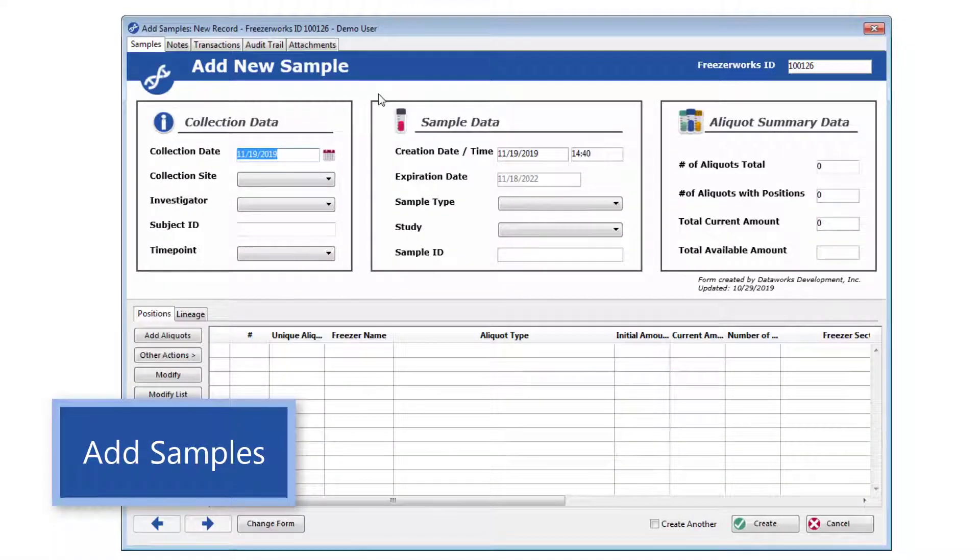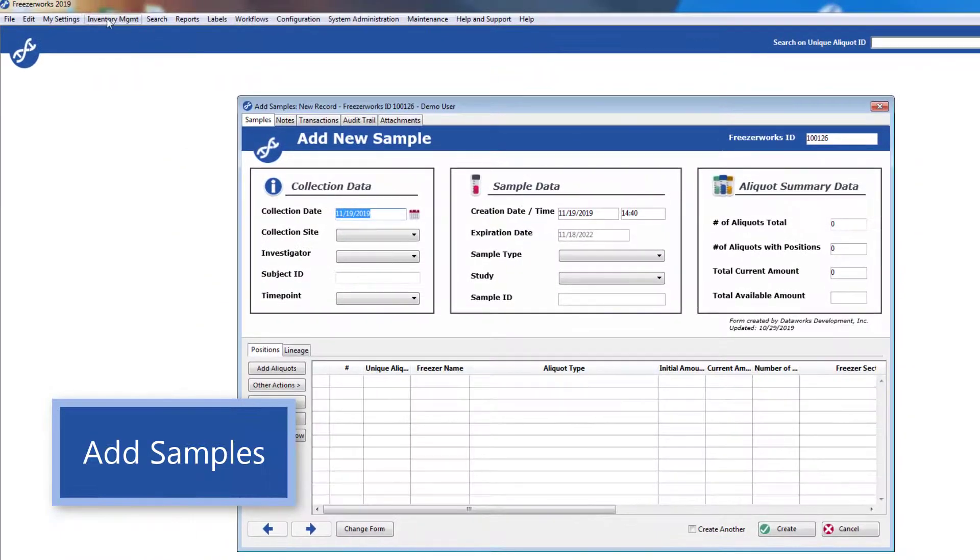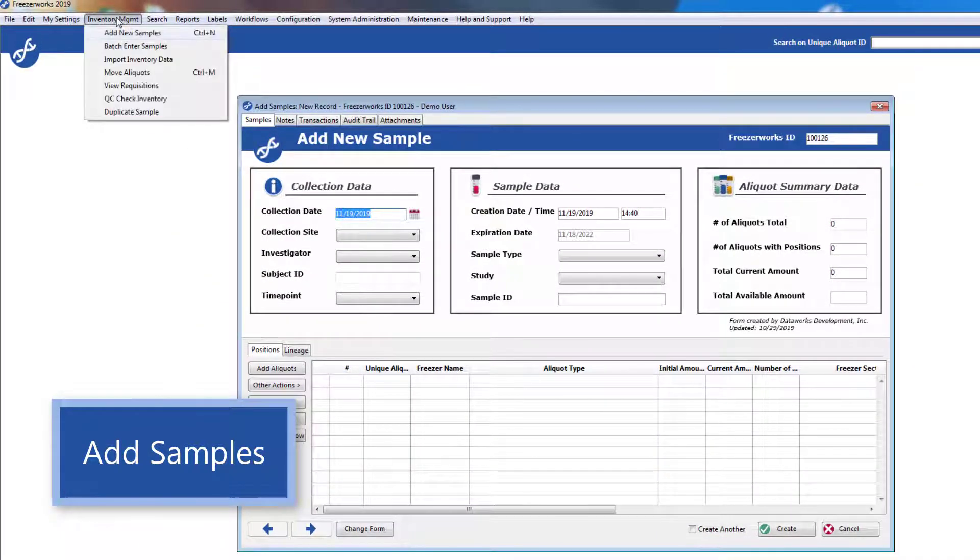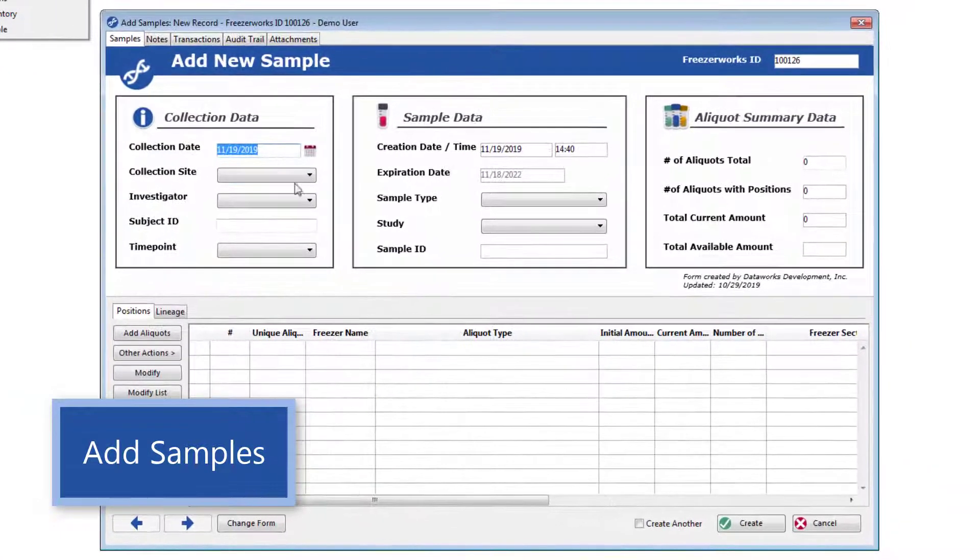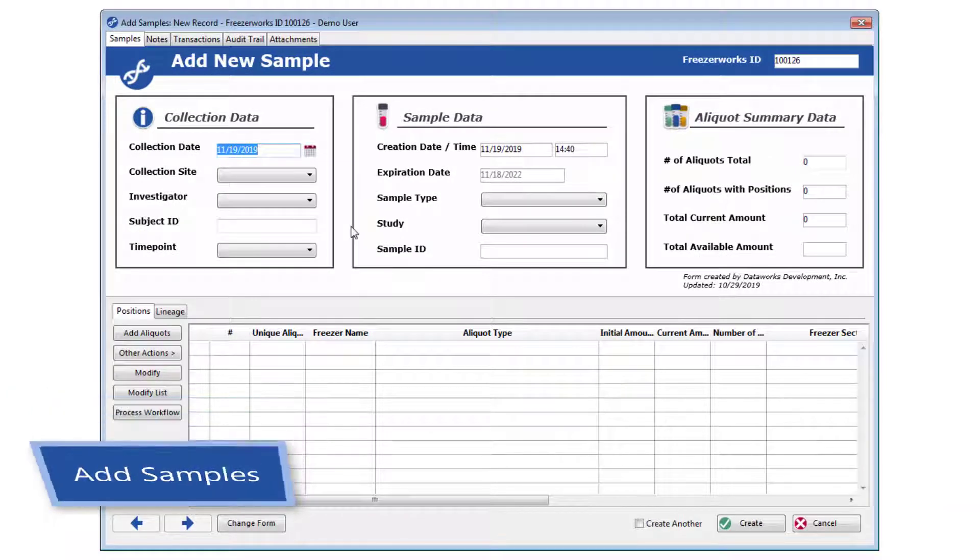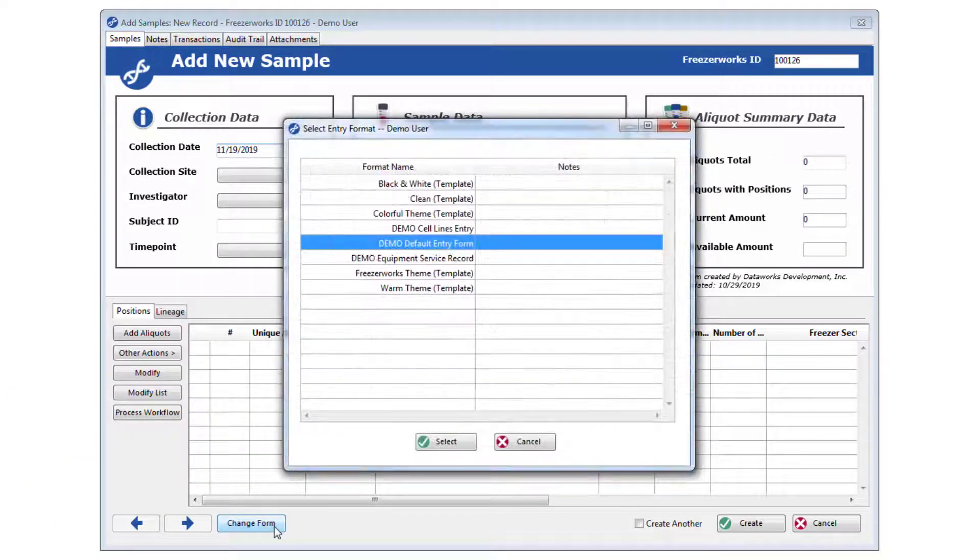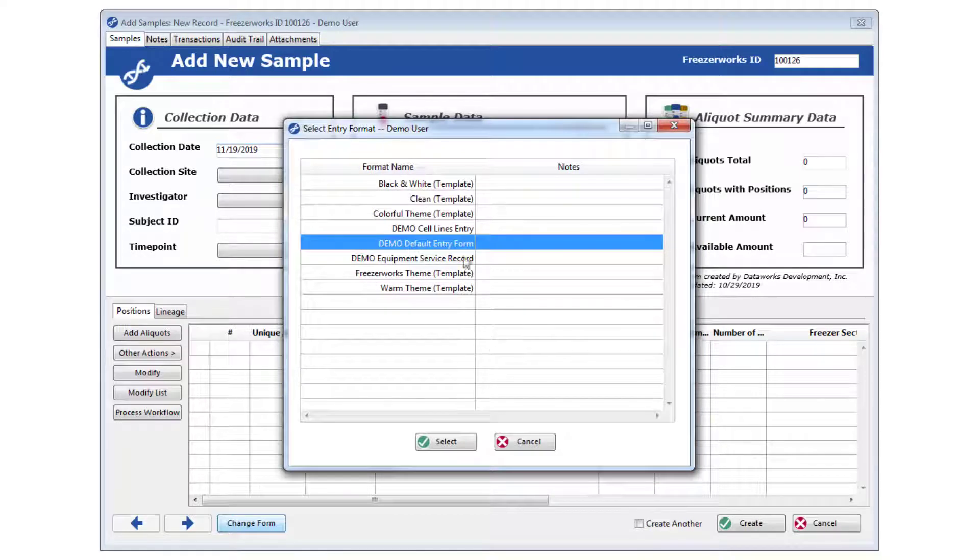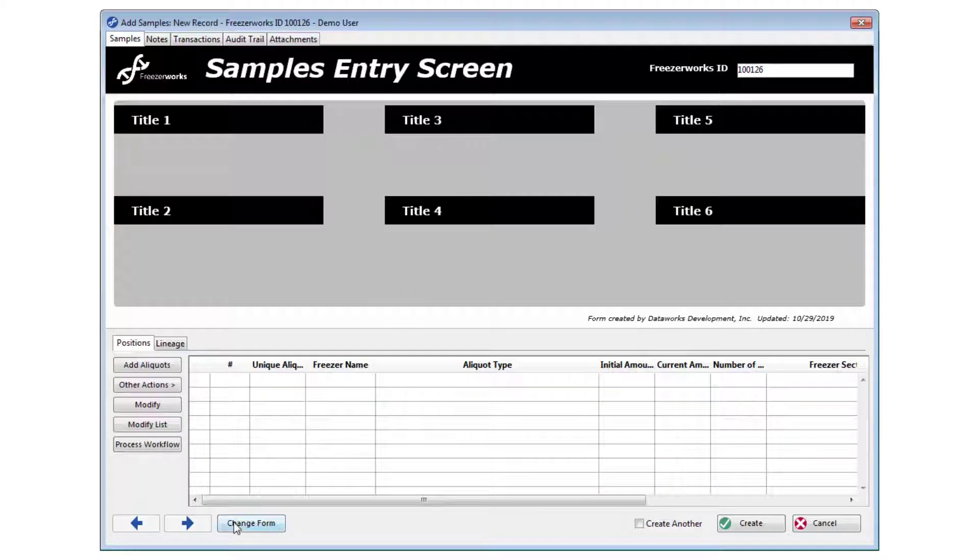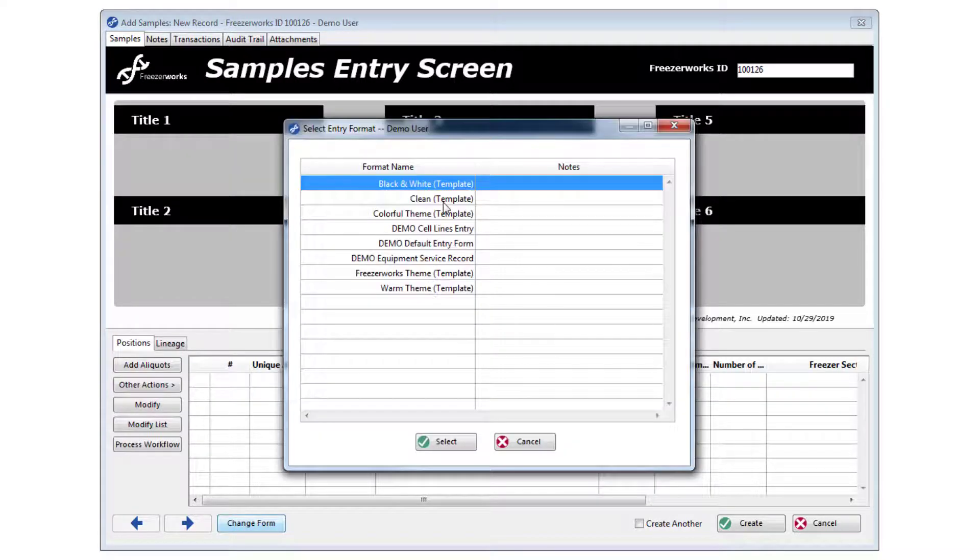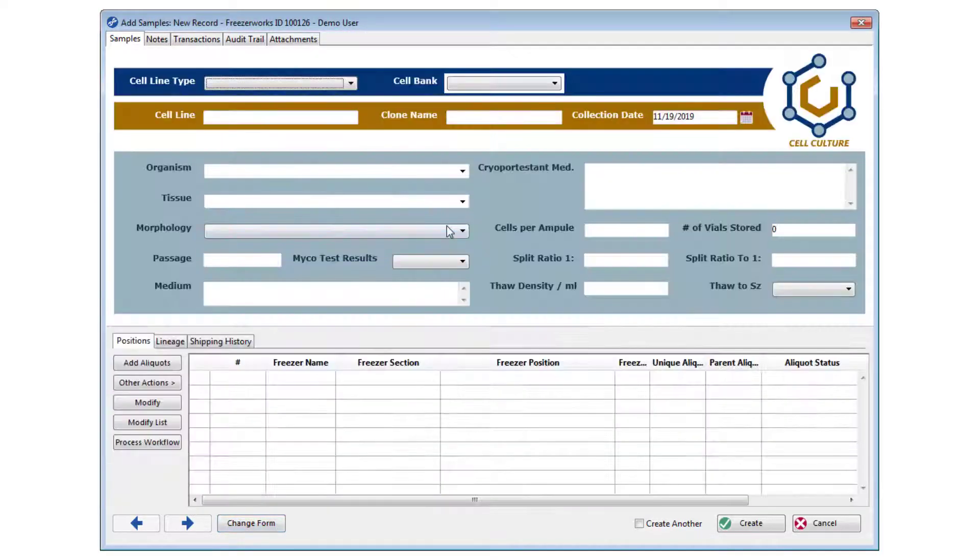You can also start creating samples by opening the Inventory Management menu and selecting Add New Samples. This is one of our examples of a samples entry form. Click Change Form to change the form on the fly and see our other examples. Your system can have multiple samples entry forms for different use cases and groups, as many as you need.